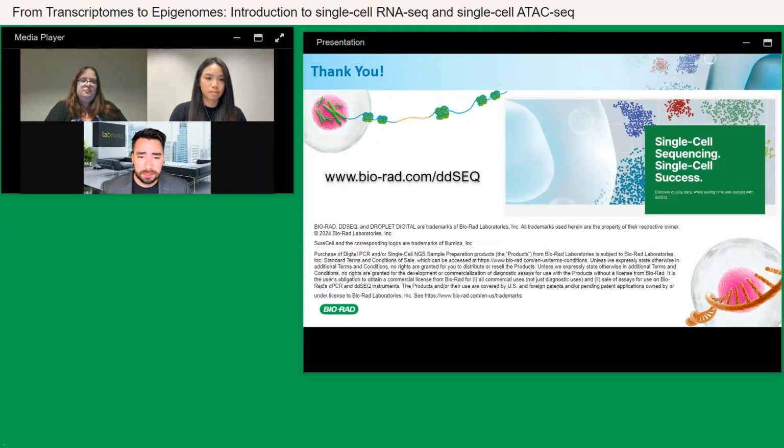Awesome, thank you. Now, are you using only live cells to encapsulate? Yeah, I can answer that one. So yes, thank you for asking that question, because one of the things I wanted to bring up is that for you to be able to generate high quality data, you want to make sure that the cells are alive, that the cells are happy and healthy, essentially, right?